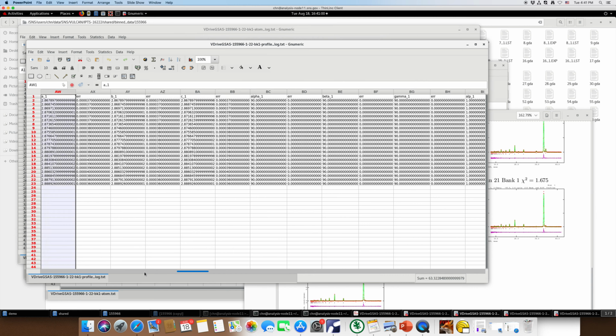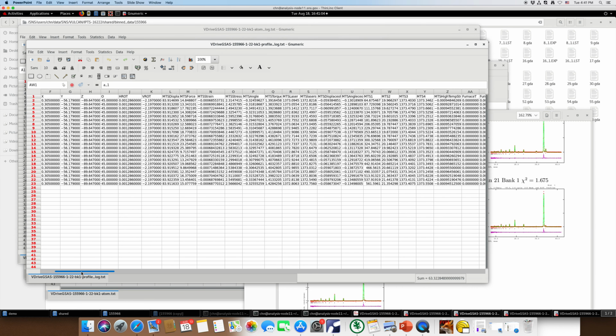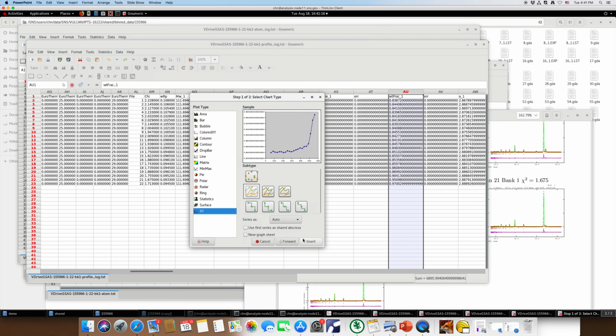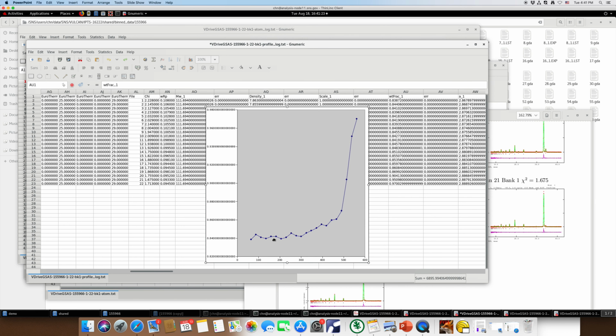For example, if we want to see the temperature dependence of the weight fraction, the temperature, and also the weight fraction here. This is a weight fraction. Okay, so we can see that the phase transformation onset happens here, and then quickly transforms. This is the FCC transformed to BCC. That's why it increased to almost 1.